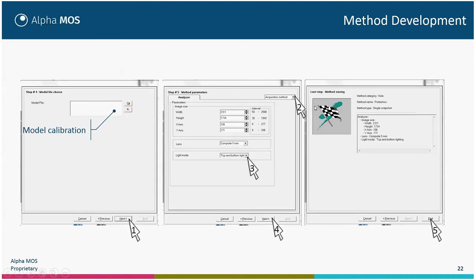Then click Next and set the image size. You can retrieve the acquisition method parameters set manually, including the lens and the light mode. If you want repeatable analysis of one product, you must always use the same lens and the same lighting mode. If the system is set with a different lens or lighting mode, it will not allow use of that method. This is important because if you create a model with one illumination type, you cannot use another illumination type to determine product quality. Then click End on the last step of the wizard.